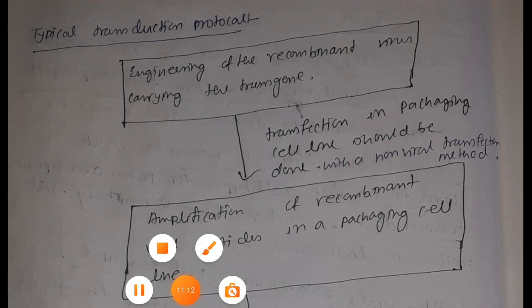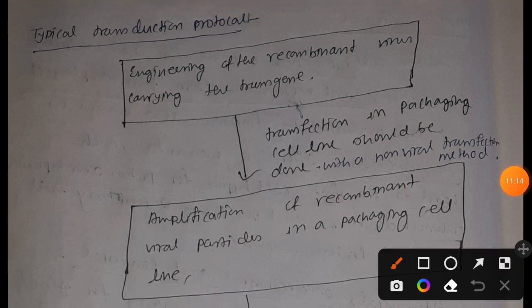Here one thing I want to mention is that most primary cells and cell lines show 90 to 100% transfection efficiency when you are using a viral vector. But there is a problem, that is the specificity. That means if your host cell does not contain the specific receptor, the transfection will not happen. It provides you good specificity, no doubt about this, but it is a disadvantage too.